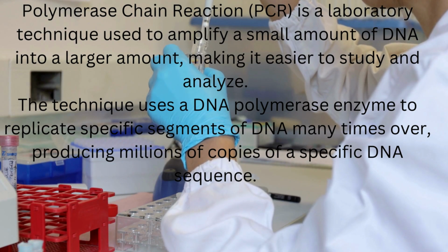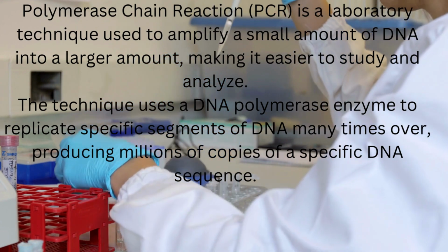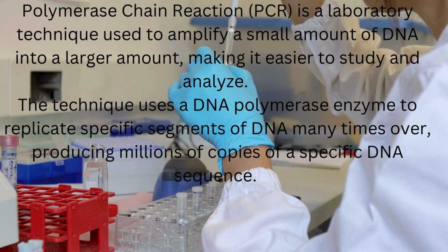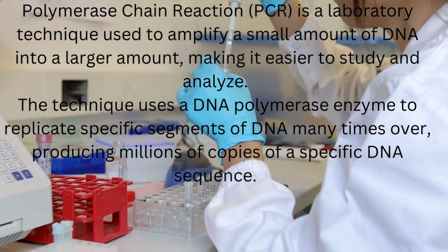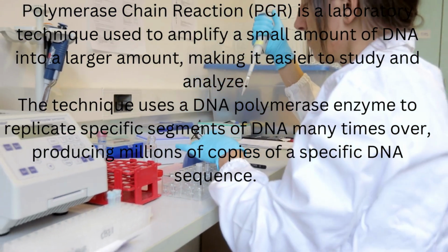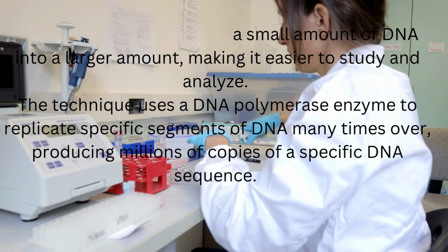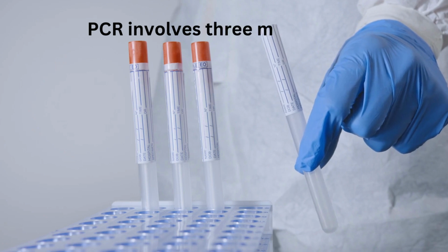Polymerase chain reaction, PCR, is a laboratory technique used to amplify a small amount of DNA into a larger amount, making it easier to study and analyze. The technique uses a DNA polymerase enzyme to replicate specific segments of DNA many times over, producing millions of copies of a specific DNA sequence.